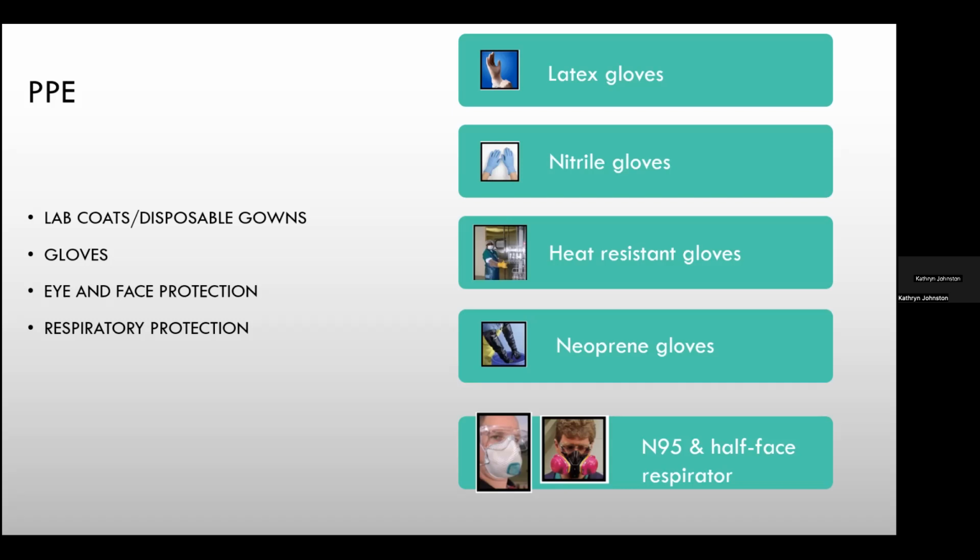the other lab coats that aren't flame resistant, especially those that are polyester synthetic fabrics, that synthetic fabric can burn, it can melt, it can shrink, and it can stick to the skin. So it's really important that if you're working around open flames, that you don't have a synthetic lab coat. You do want to wear a lab coat when the hazard assessment within the laboratory determines that hazards are likely. And a good rule of thumb is to wear a lab coat when working in the lab.